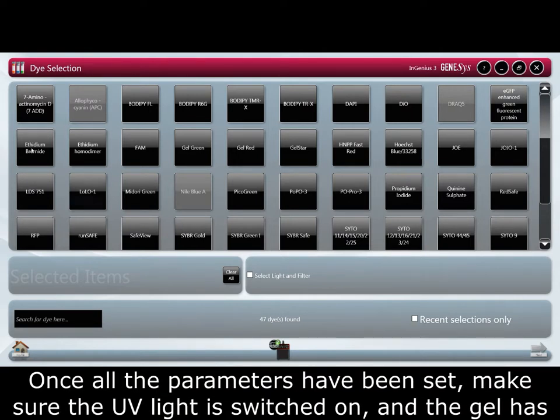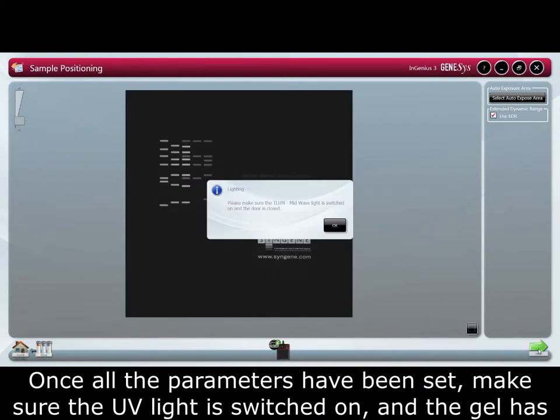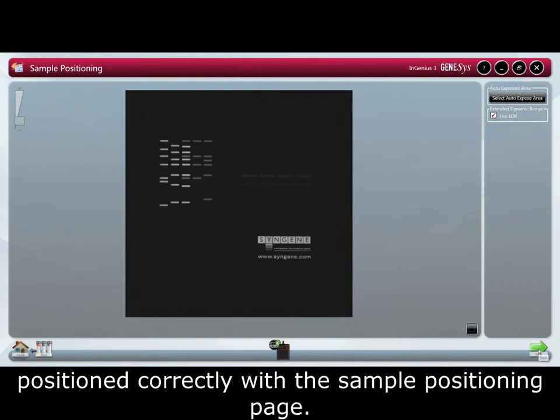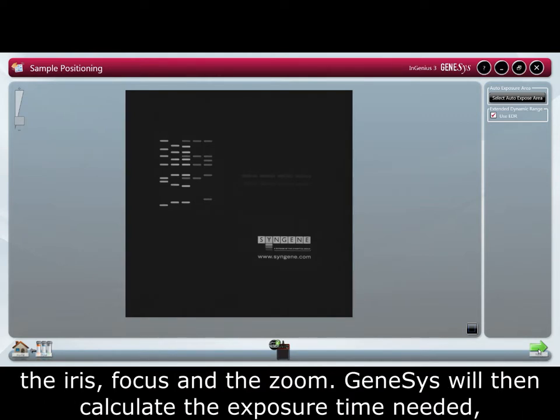Once all the parameters have been set, make sure the UV light is switched on and that the gel has been positioned correctly with the sample positioning page. As the InGenius 3 system has a manual zoom lens, use the controls on the camera to adjust the iris, focus, and the zoom.